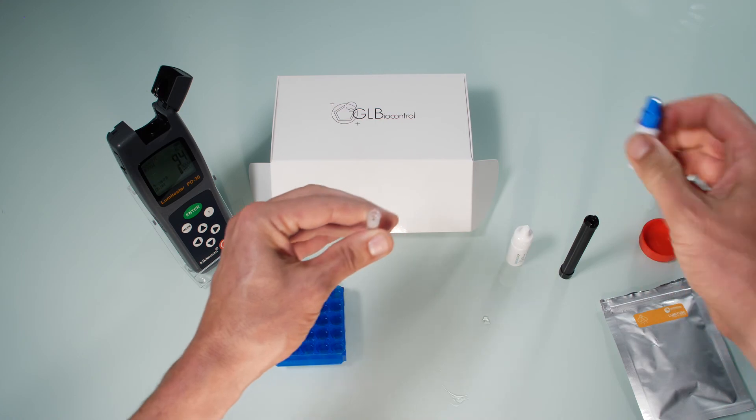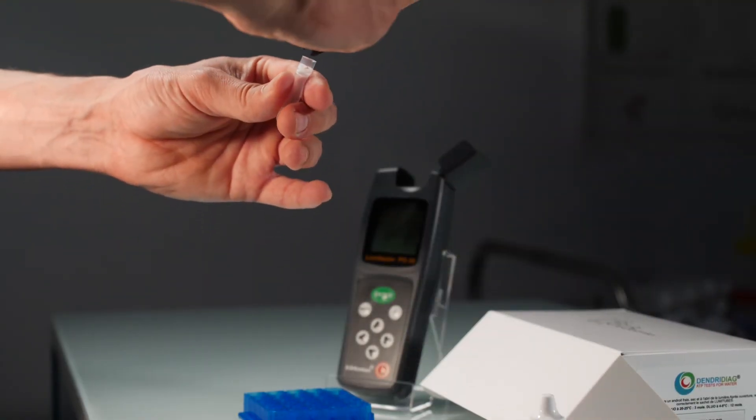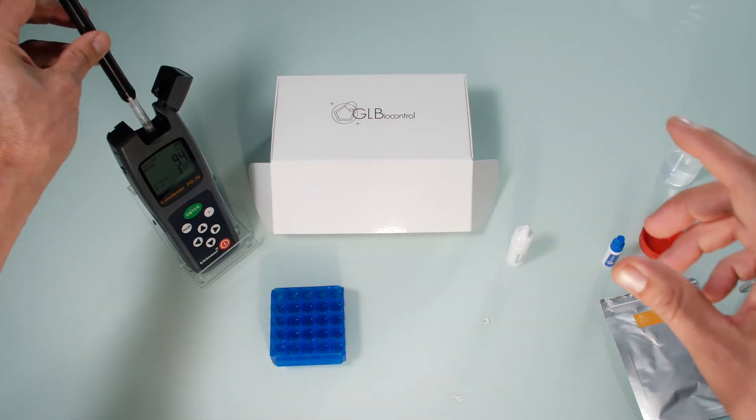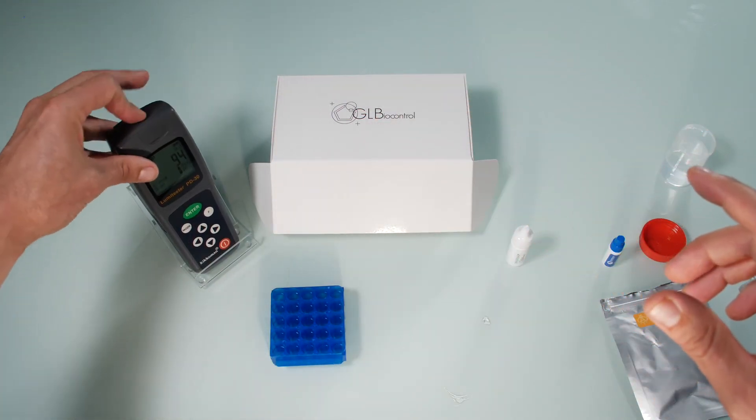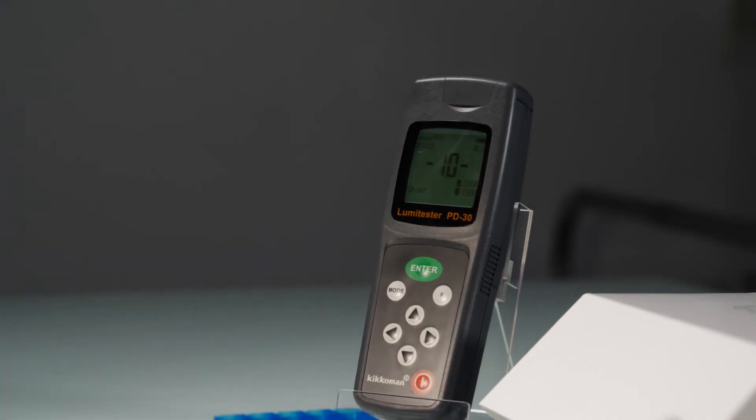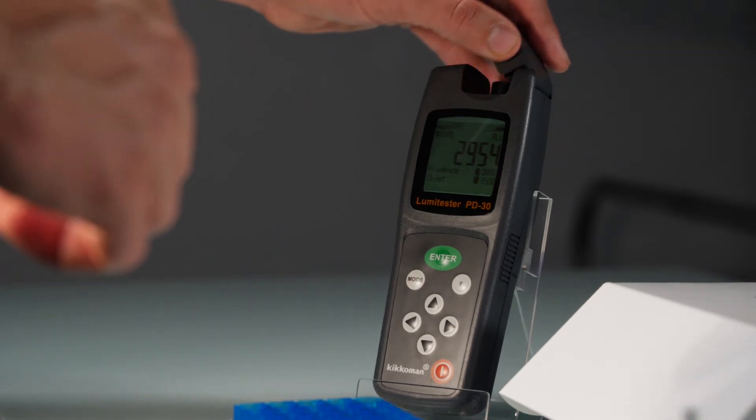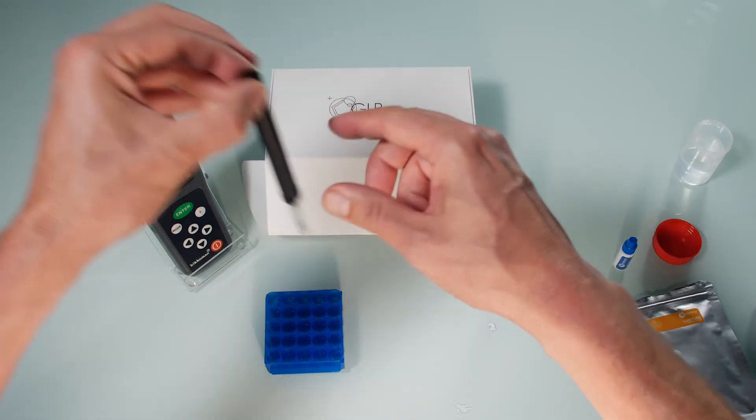Now once again clip the lumi tube onto its holder and tap it slightly on a flat surface to mix it. Reinsert into the device. Close the lid and press enter. Once again the calculation will take 10 seconds and the result referred to as value R2 is displayed. Note it down.